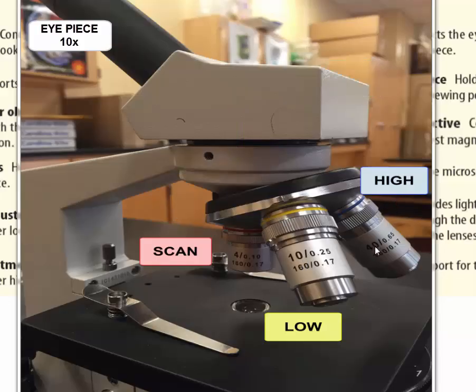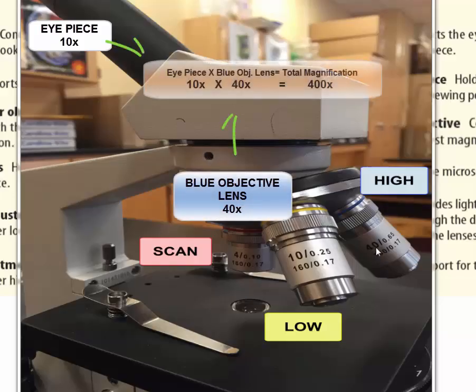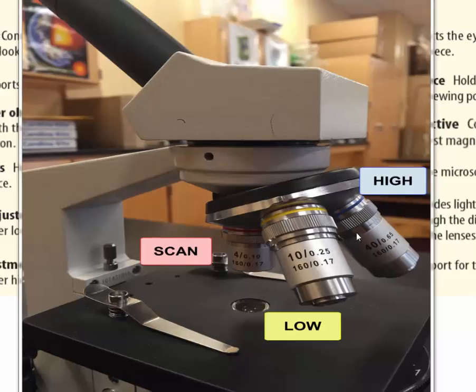The high power lens has a 40 marked on it so this is 40 power and when you multiply it by the 10 power of the eyepiece this gives you 400 power in total magnification. So these are our three objective lenses and these are the magnifications that they have.